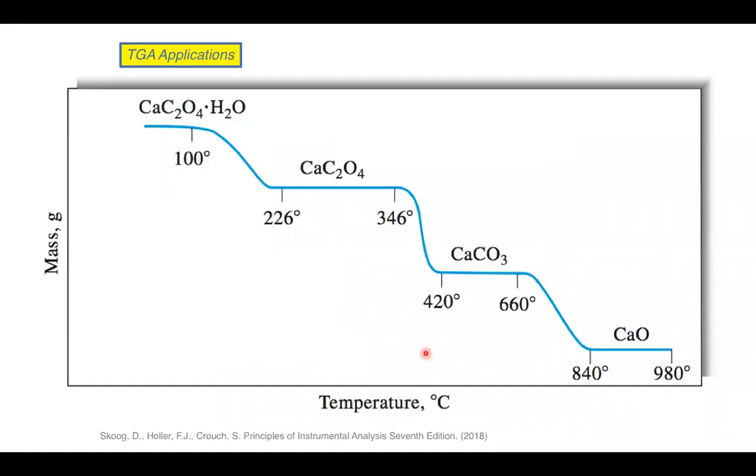So here is another example. This is looking at the decomposition of calcium oxalate. What we're looking at here is the different processes going along.